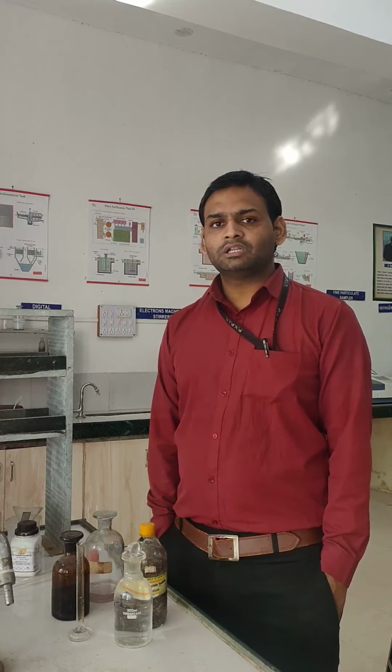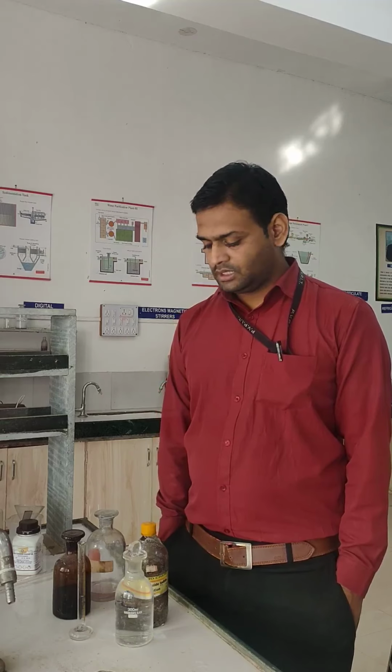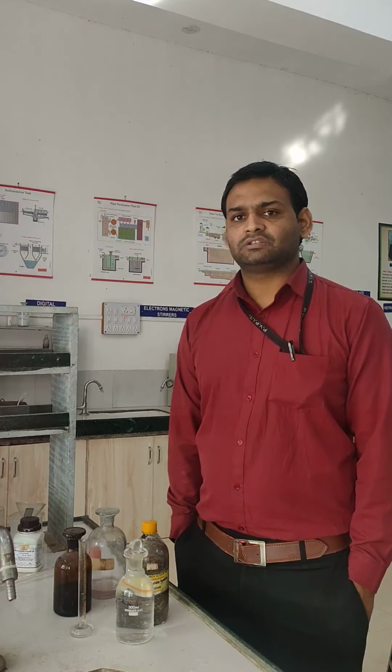Then what are the instruments required for this particular experiment? The instruments are burette, pipette, conical flask, measuring cylinder. These are required because this is a titration-based experiment, so in this experiment we require all these glasswares.